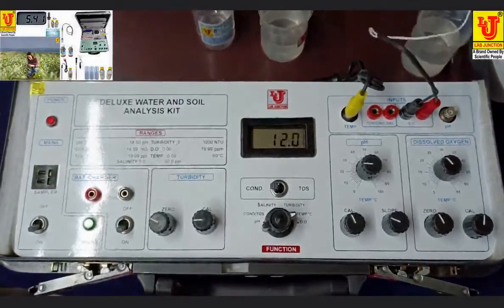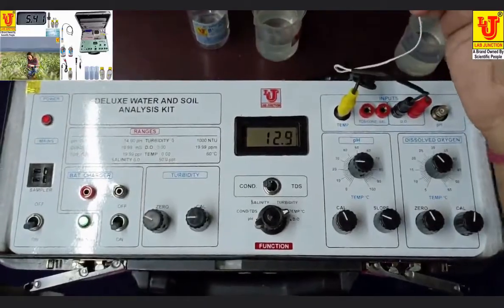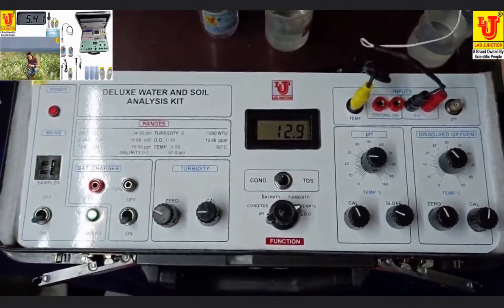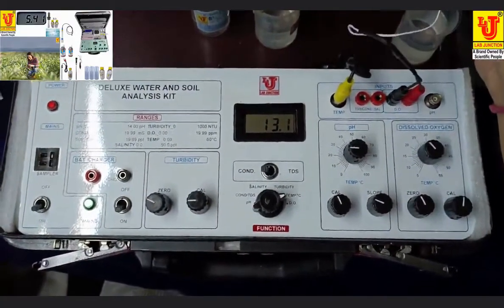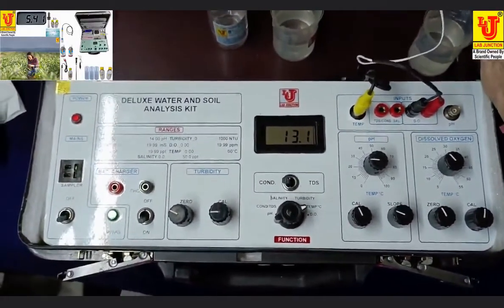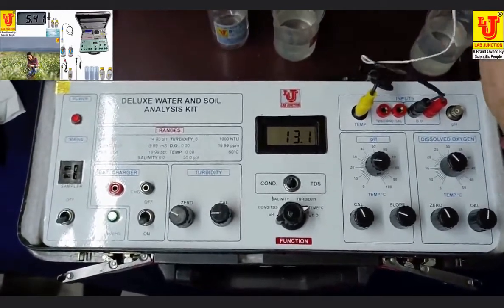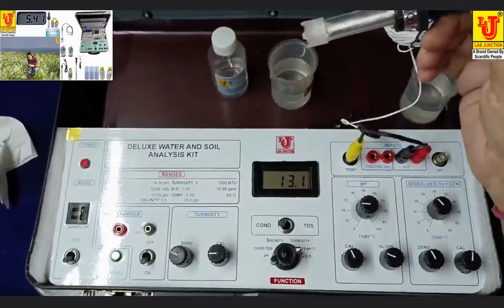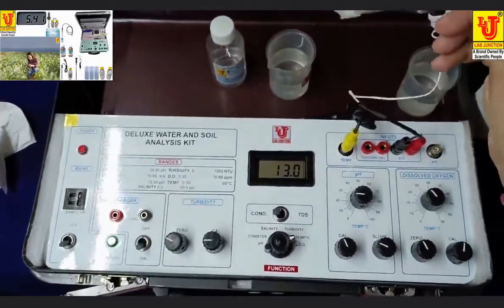Now your dissolved oxygen probe sensor is okay. Now dip your DO probe in your sample directly and check dissolved oxygen values in ppm. These are mostly used in hydroponics, aquaculture, and fishing. Now, this parameter is successfully calibrated. Now, your DO sensor is ready for use for taking analysis.